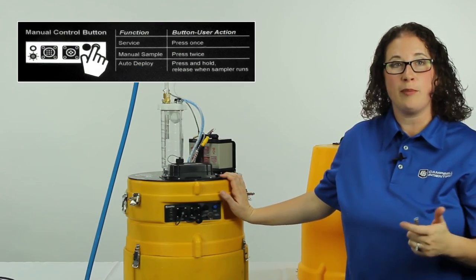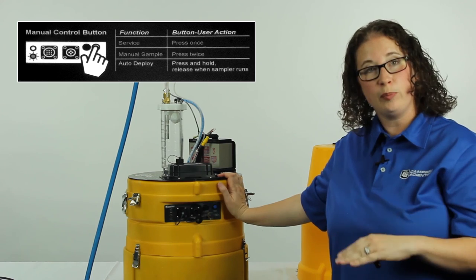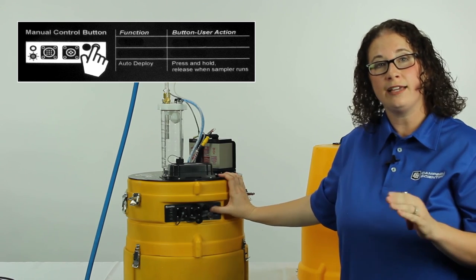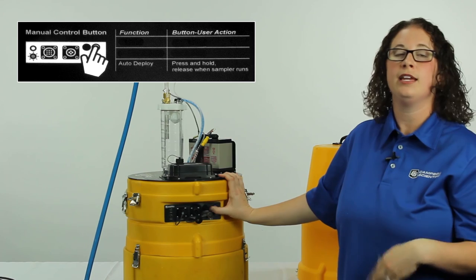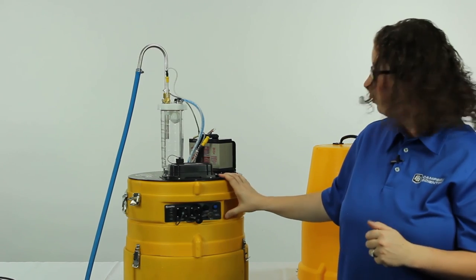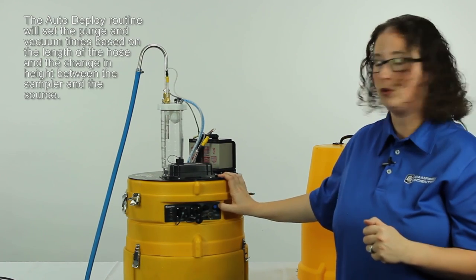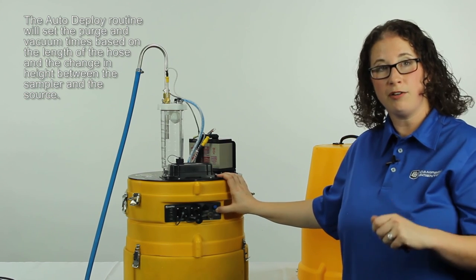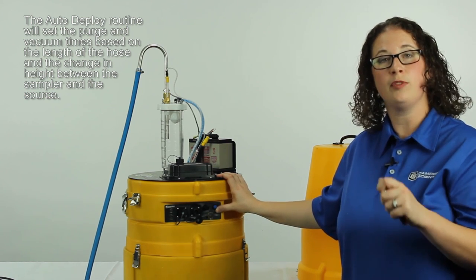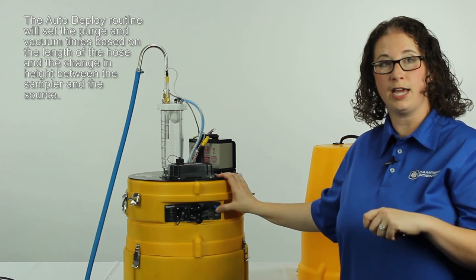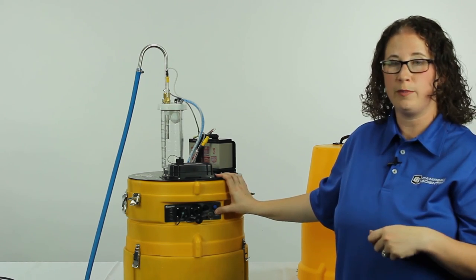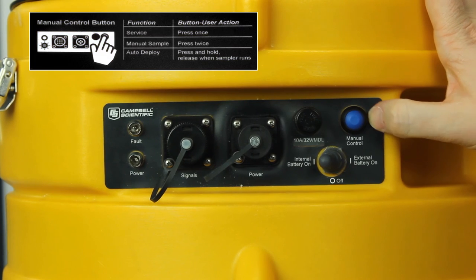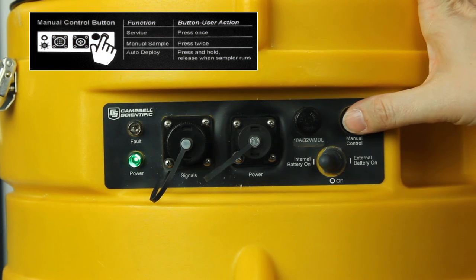A good first step when you're at a new site, you've never put a sampler out here, and you're not exactly sure what your purge time or vacuum time should be, is to run the auto deploy routine. We do this by pushing and holding the manual control button. When we run the routine, this will monitor and calculate the vacuum, the purge time, the vacuum time, and the sample drop time for you. We're going to push and hold the button until the sampler starts to run.